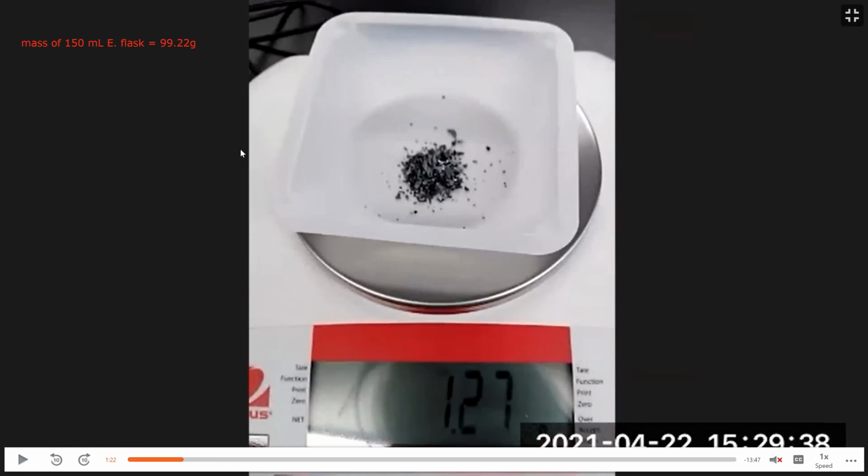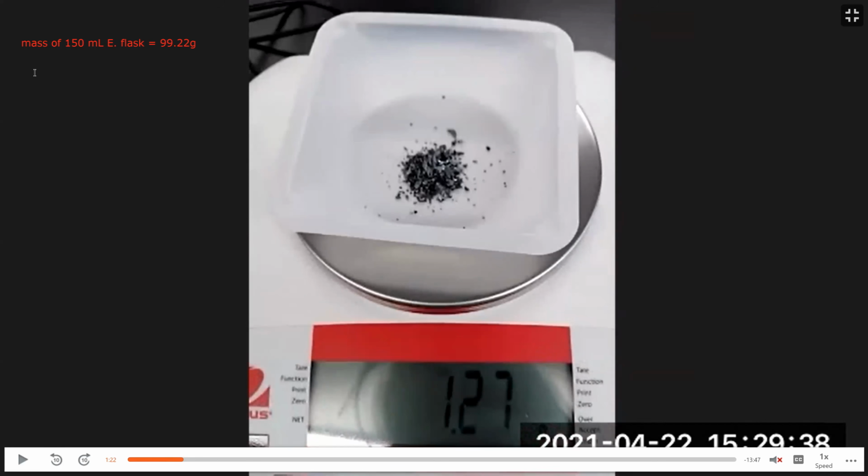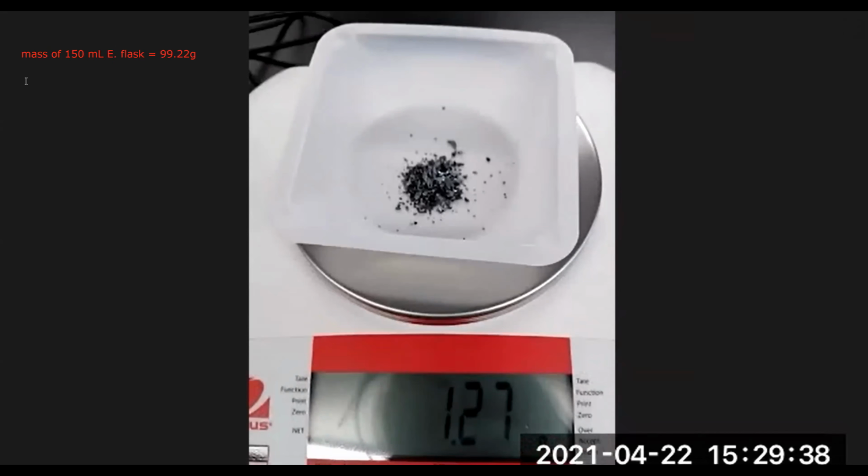So our mass of iodine is 1.27 grams. In your experiments, you'll be weighing out 1 gram of iodine.